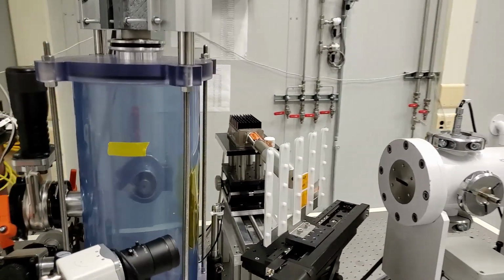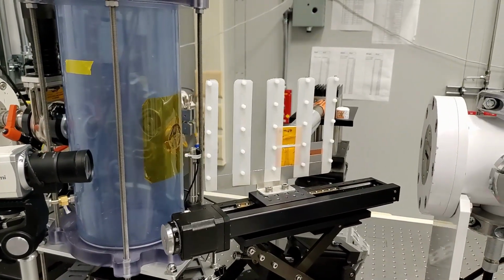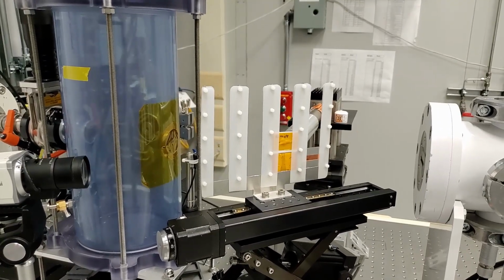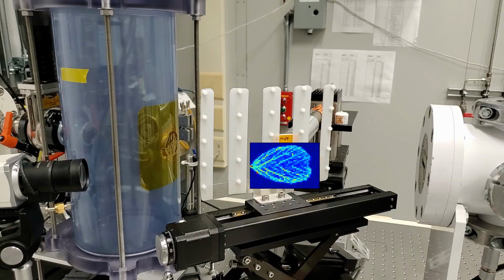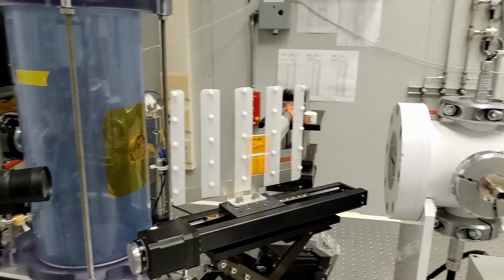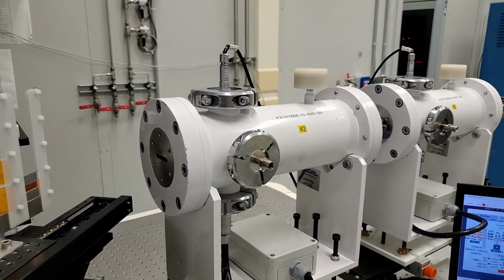Here is a 2-dimensional motion platform that samples can be mounted on. It can accommodate larger samples or a larger number of samples than the vacuum chamber, and is easier to work with if a vacuum is not required. In addition, it can be used to scan the beam across the sample in 2 dimensions to produce elemental distribution maps. A second ion chamber after the sample monitors the amount of light that passes through the sample.